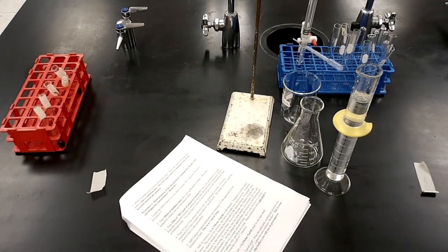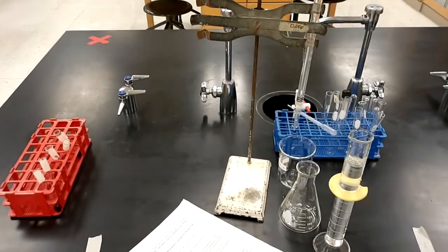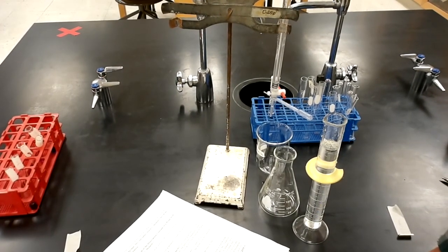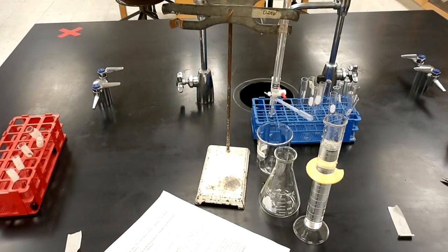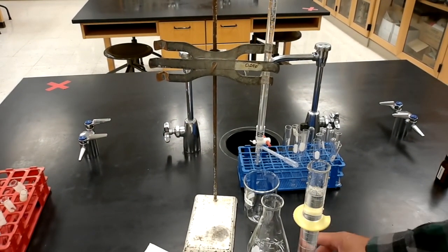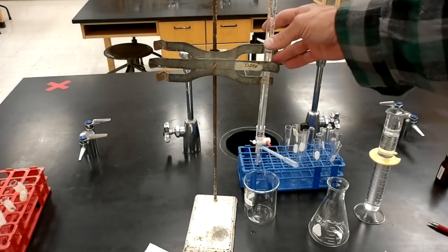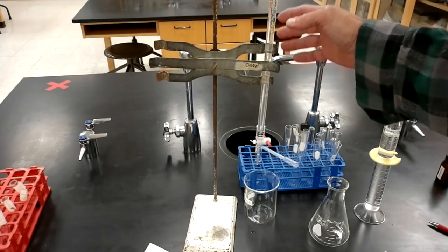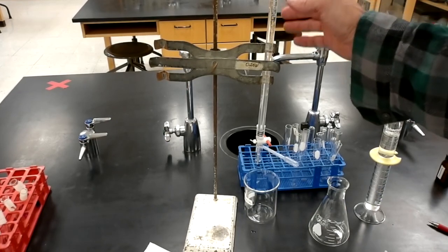All right, what we're going to look at now is procedure 3. This is basically determining the hydrogen ion concentration in an acid. Now what we're going to use is this device right here. This is a burette. It's just a fairly accurate way to measure volumes.